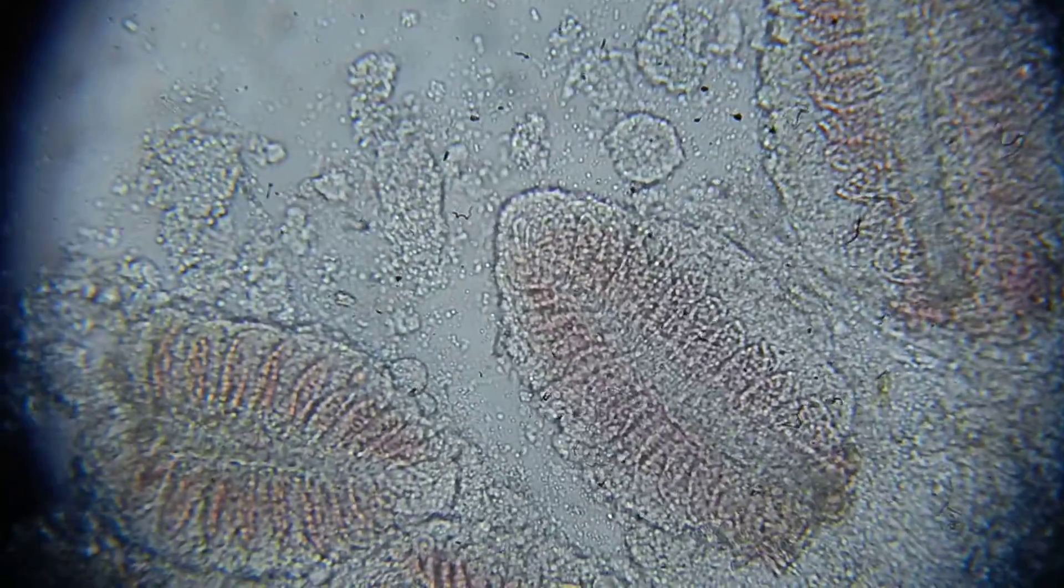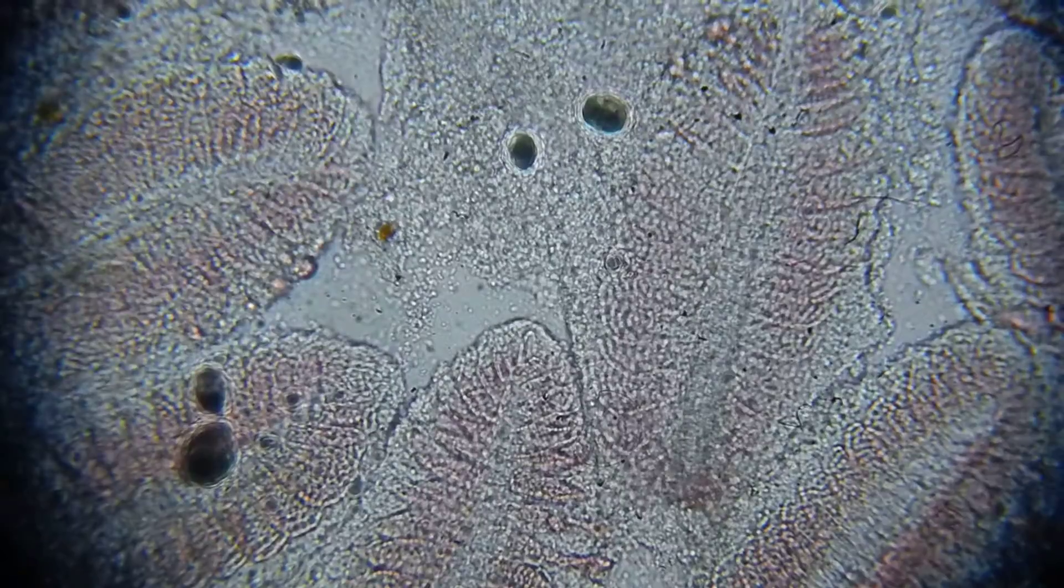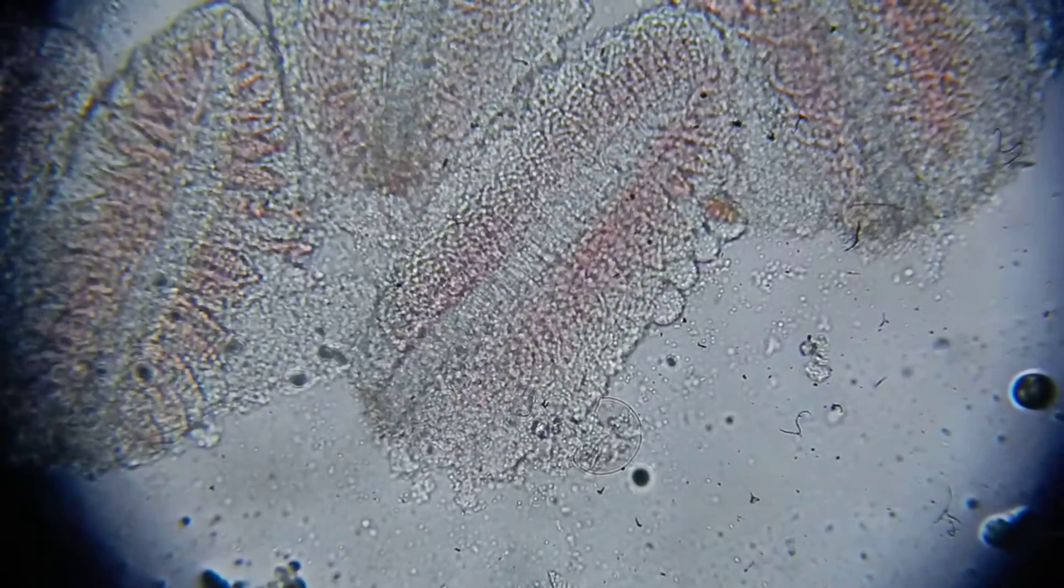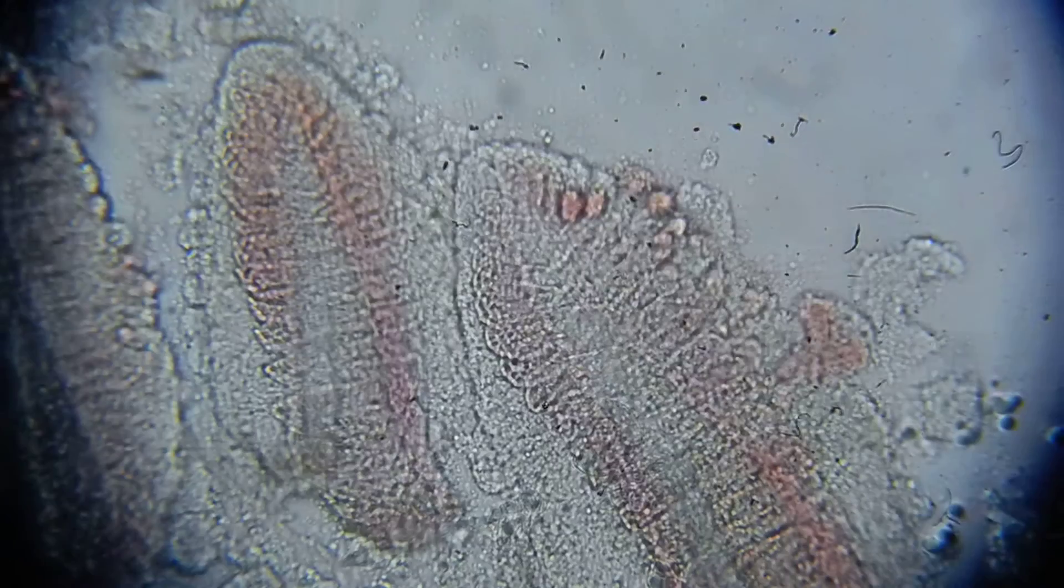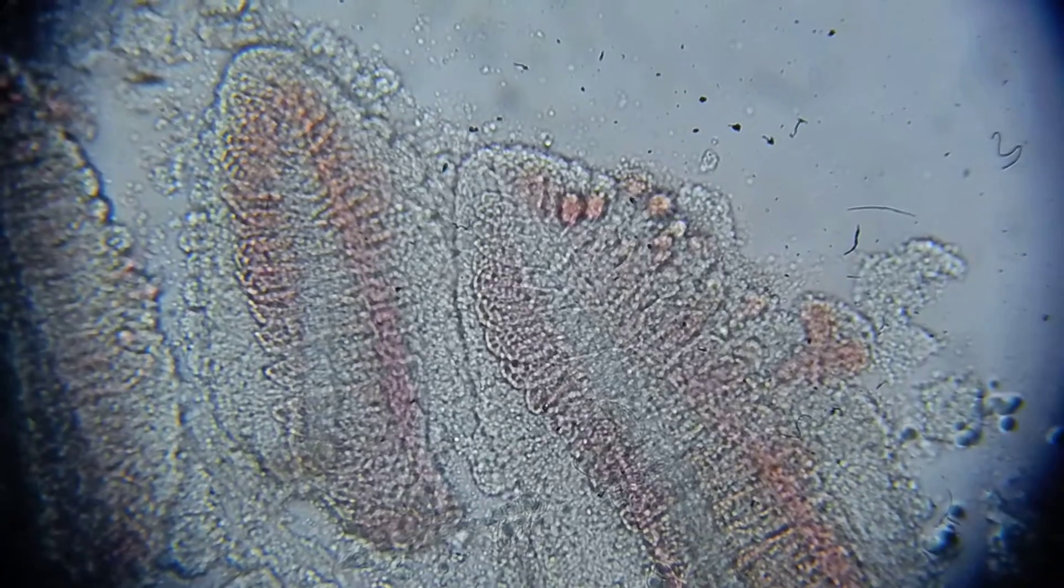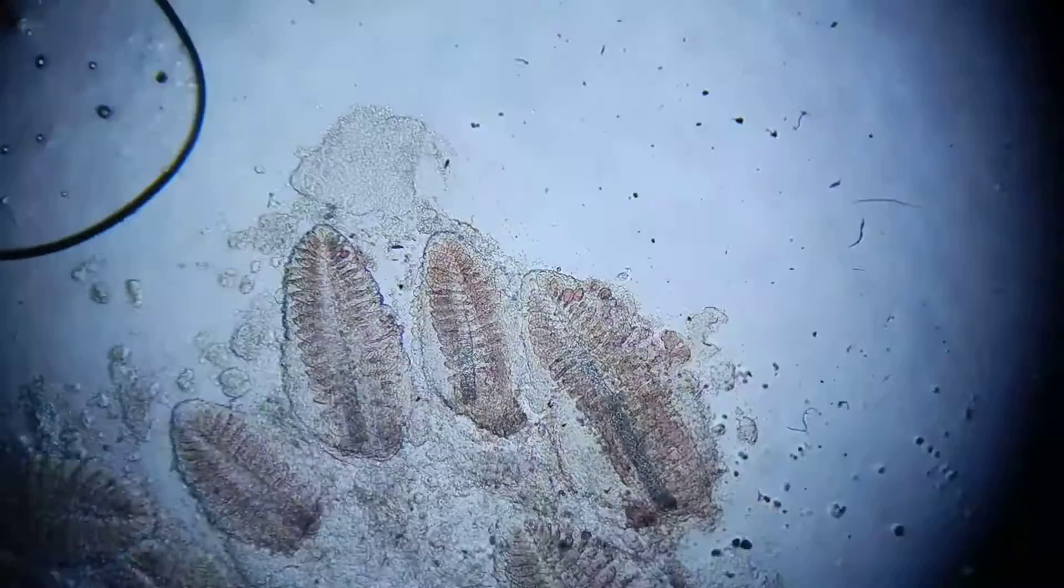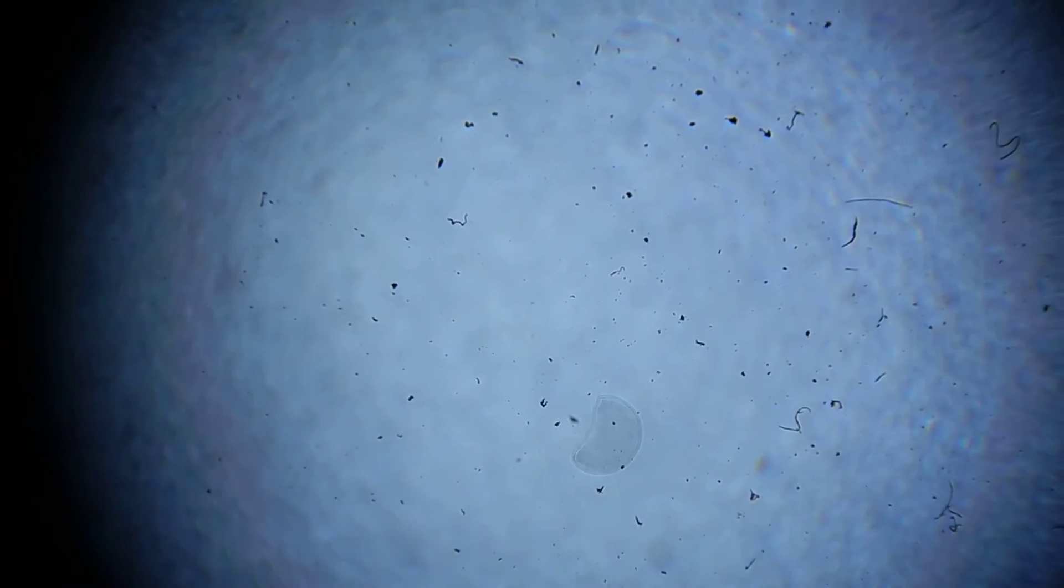So over here, we're sort of scanning around. And we're seeing basically nothing moving, just bits of gills, not too much mucus, no evidence of rupture of blood vessels, apart from some which may be artifactual from collecting the specimen. So what I'll put on next is a slide.